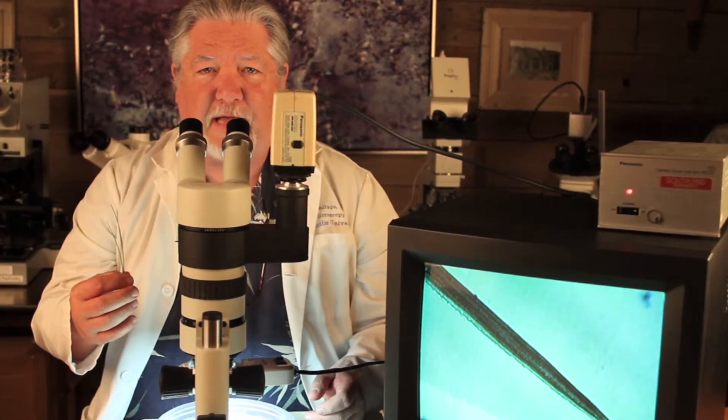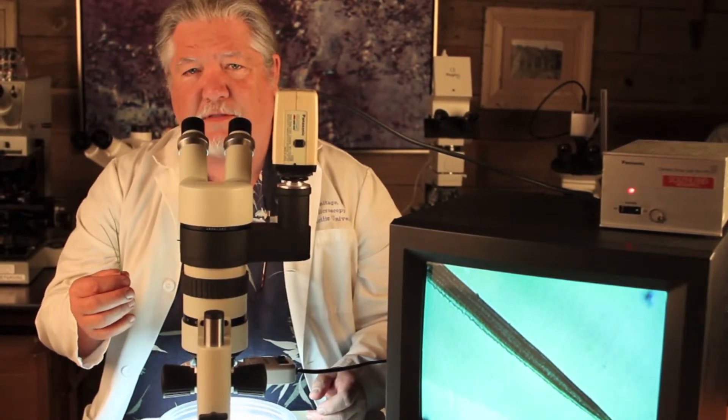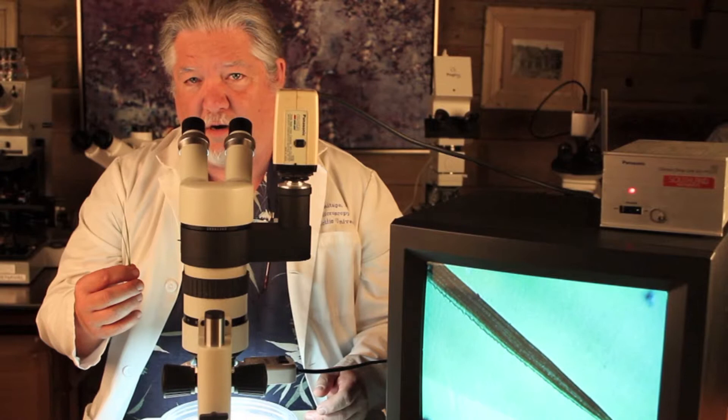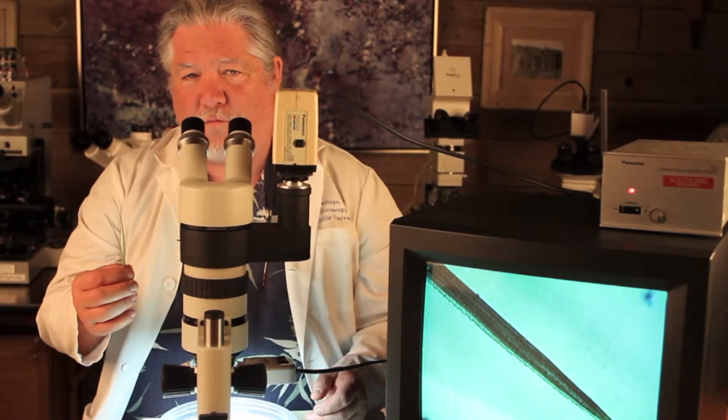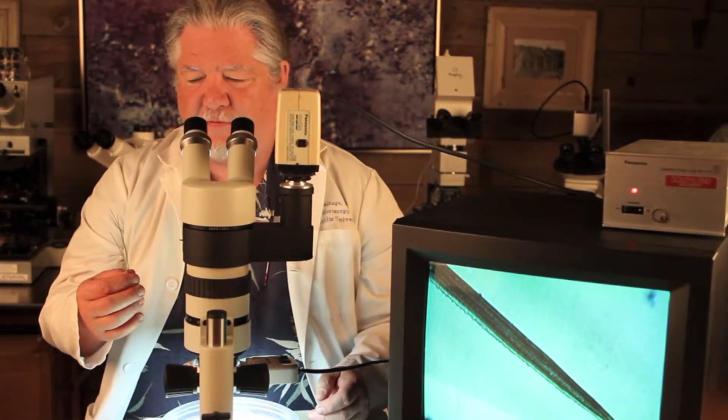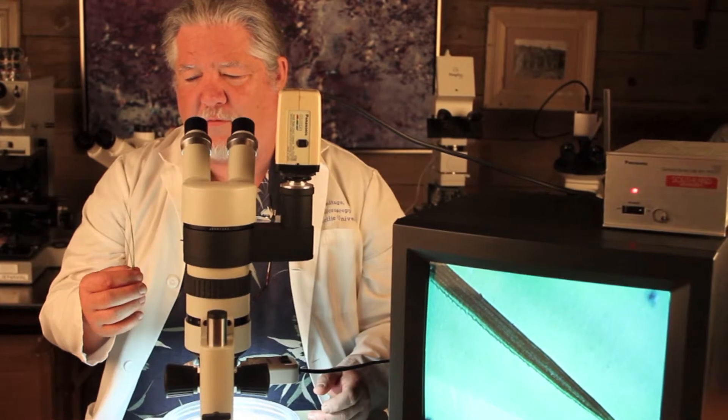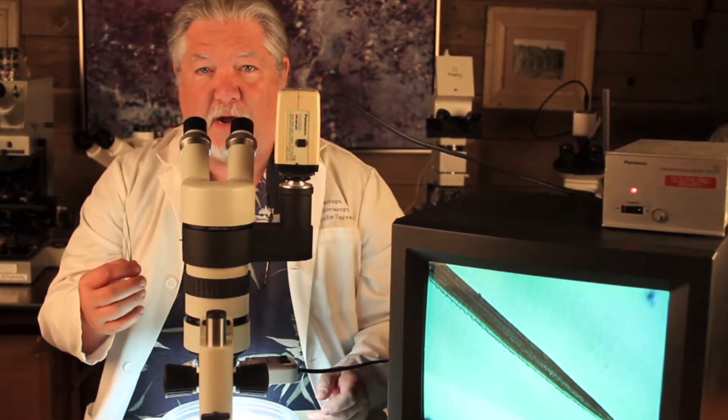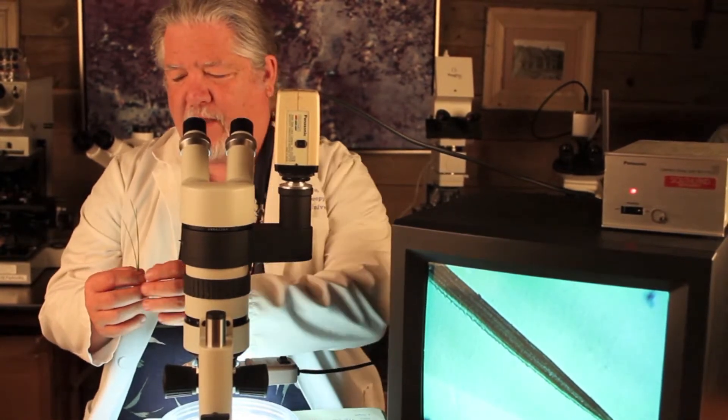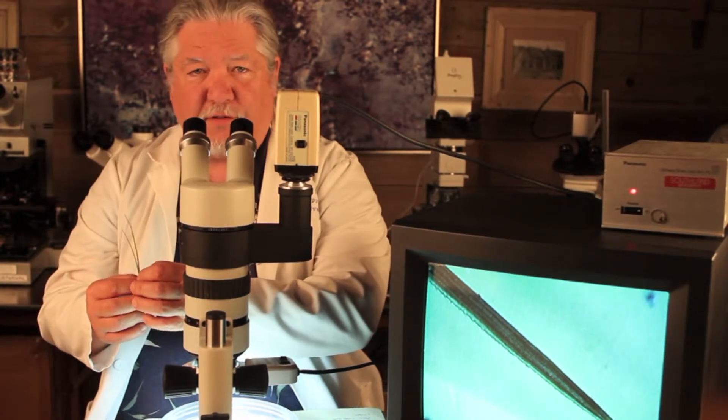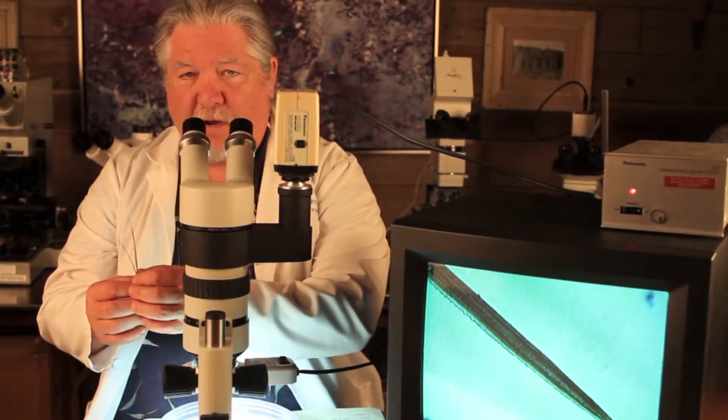Hi folks, we brought some of these pine leaves into the lab to examine. Pine needles as we know them, but these are leaves. They do perform photosynthesis like other leaves. They're a little different though in several respects. Some people call these modified leaves, but I don't believe they're modified. I think they're designed to do exactly what they do and they do it well.